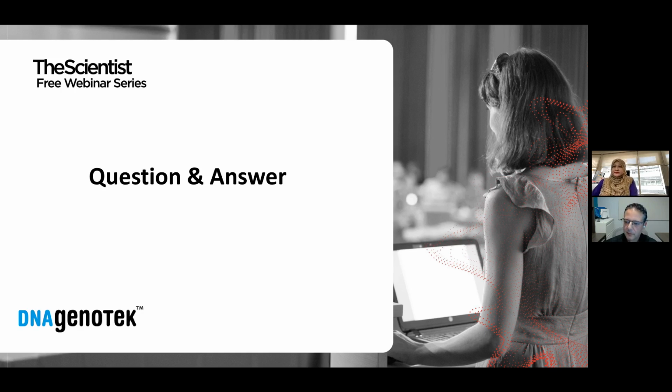Question for Mike. Are there any cons or negative effects beyond 1 hour of incubation? No, there aren't any negative effects beyond 1 hour. In fact, we have tested incubation for much longer periods, like multiple days over the course of a long weekend. It's fine if you need to leave the samples in the incubator longer.